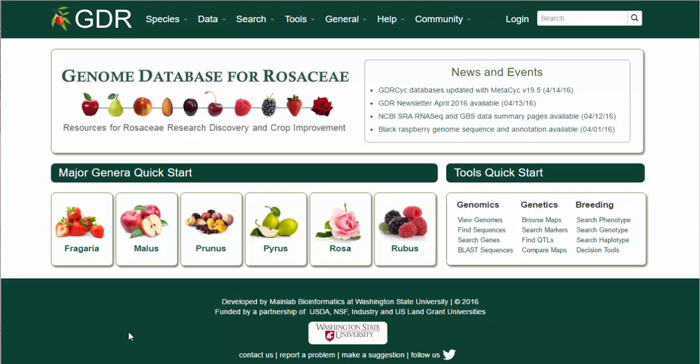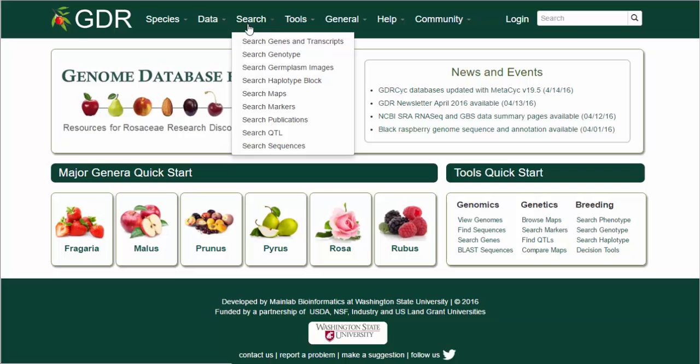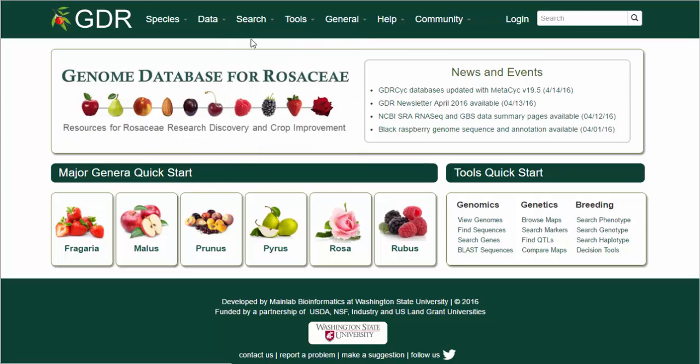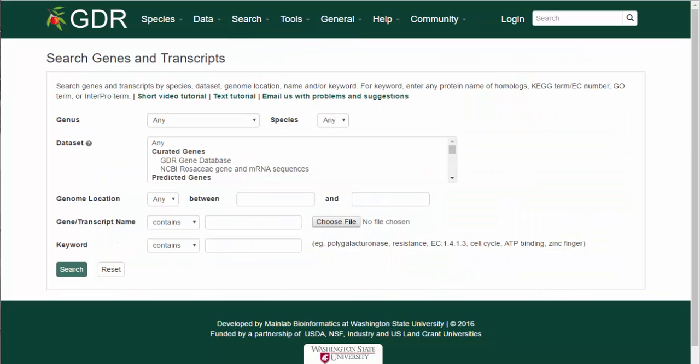To search genes and transcripts, open the search menu and select Search Genes and Transcripts. The Search Genes and Transcripts page allows you to search sequences that are available in GDR with several different parameters.